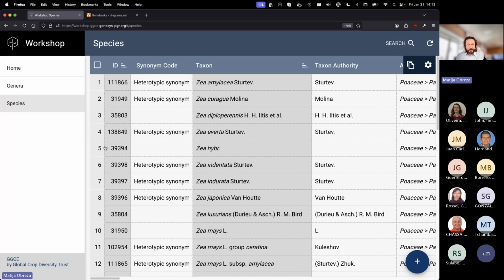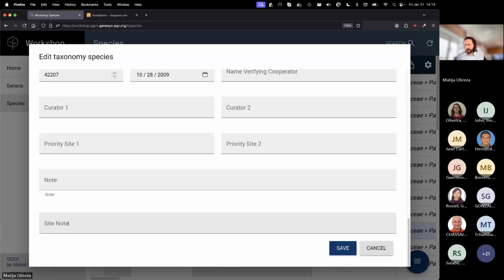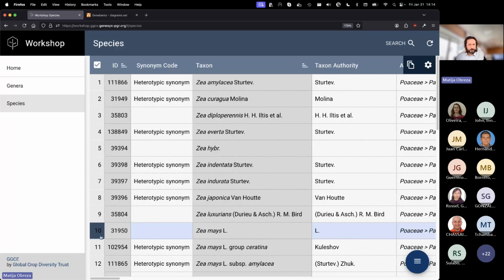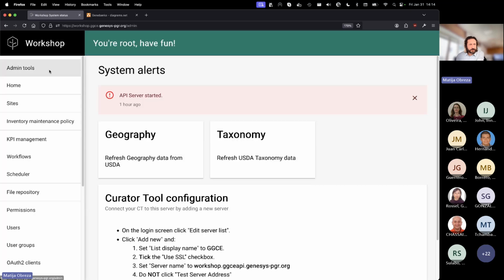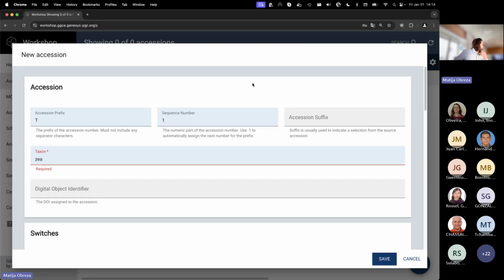I just want one so that I have an example. Oh, it's not modifiable. I'm sorry. Hold on. Unfortunately, the taxonomy search has failed right now. Live demos are always a bit tricky. Chrome. Juan Carlos, can you register a taxonomy quickly of something in the database and tell me what it is? All right, we'll get back to the taxon.